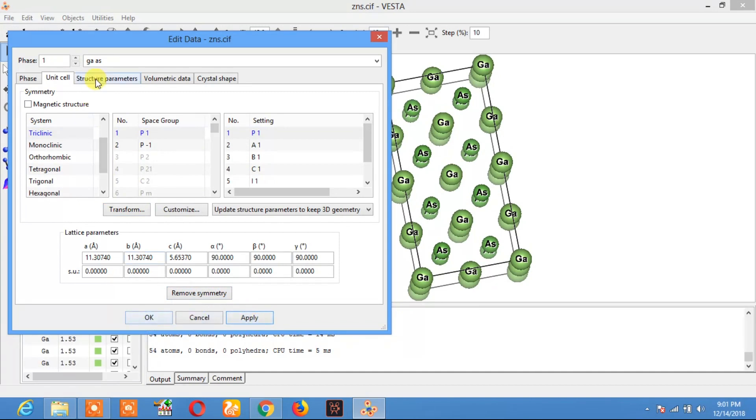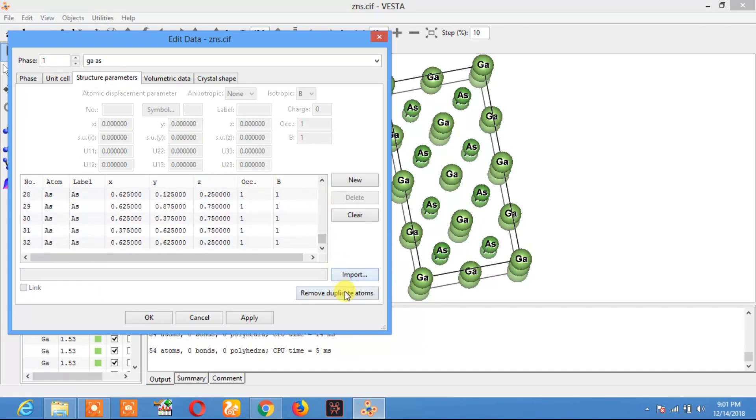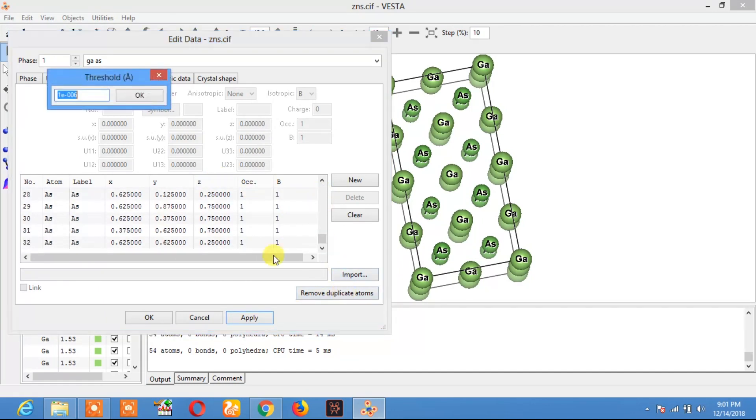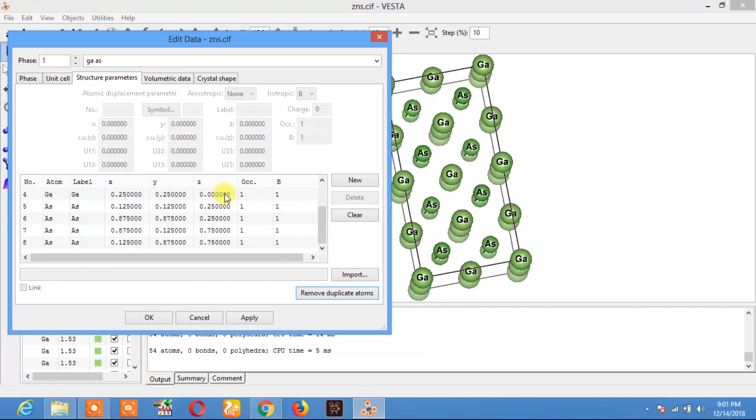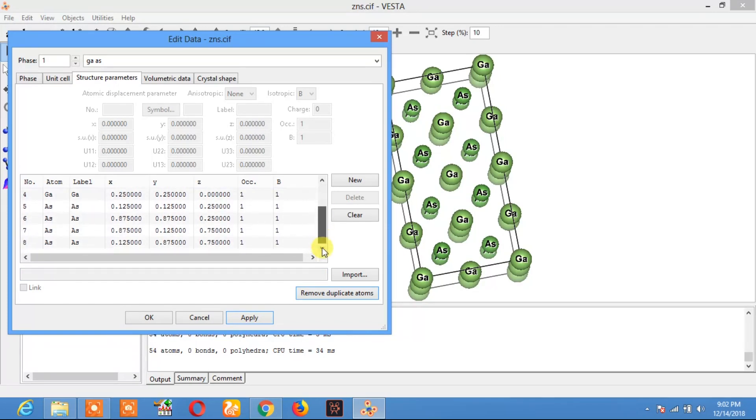Now go to Structure Parameter. Remove duplicate atoms, then apply. Here you see the atoms present in our material. There are total eight atoms in this crystal structure.